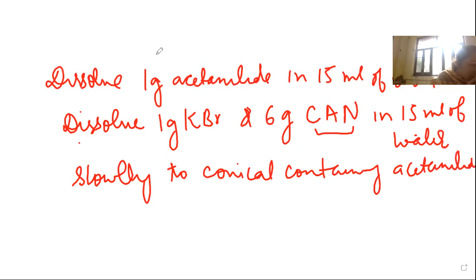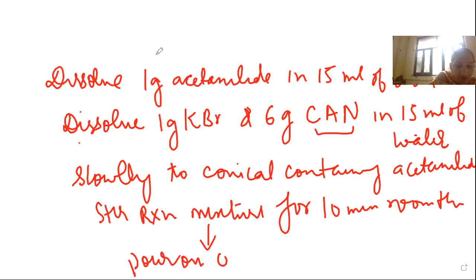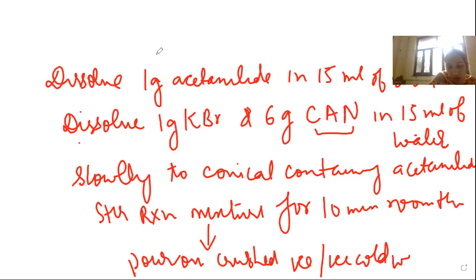When the addition is complete, we will stir the reaction mixture using a glass rod for 10 minutes at room temperature. Then we will pour this reaction mixture on crushed ice, and keep it for 10 to 15 minutes. You can use either crushed ice or ice cold water; both of them can be used.